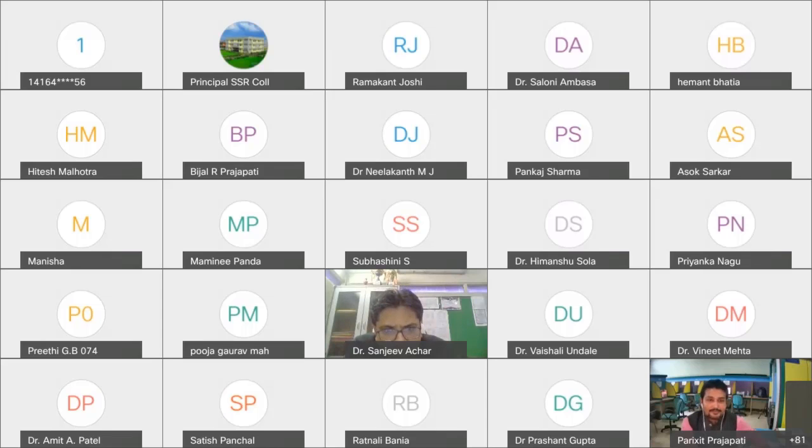Peer review is required whenever you are doing a toxicology study. In case the drug is new and you are doing a toxicology study, then it is to be done.